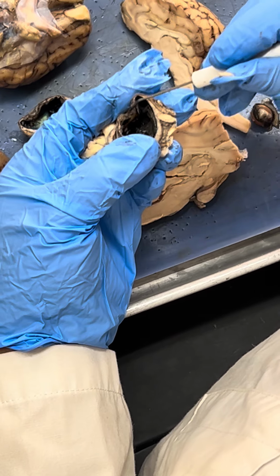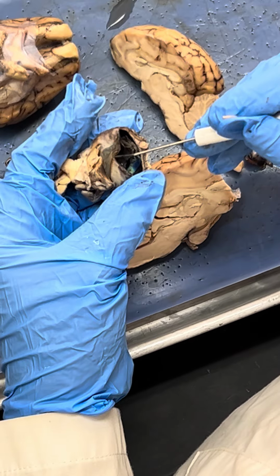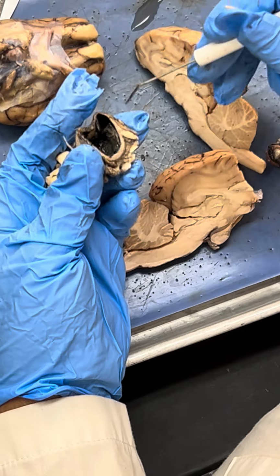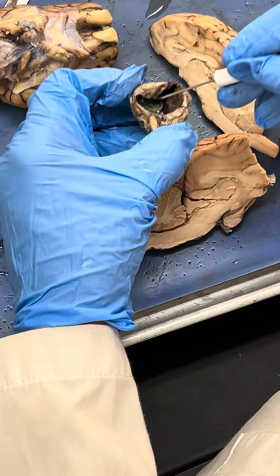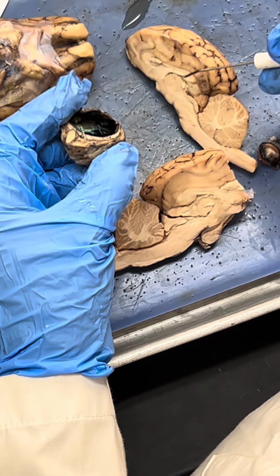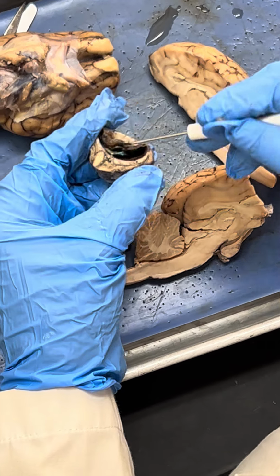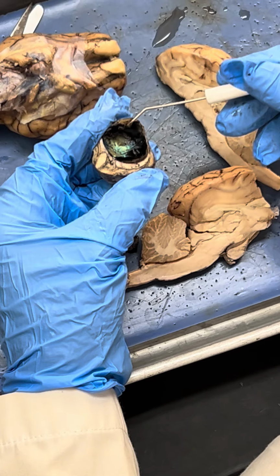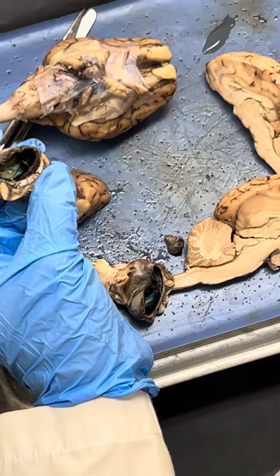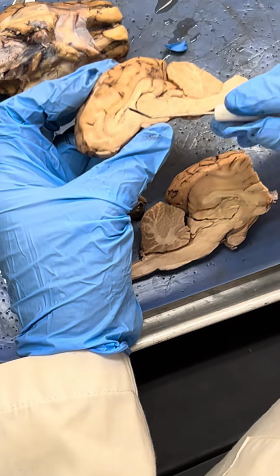Sometimes the dissection is not very good, that's why. Somewhere here is the anterior chamber and the whole back, this whole is the vitreous chamber. So this is the anterior chamber. Yes, here. See the anterior chamber. And what is this? Vitreous chamber. So all like this. So again, what is this?